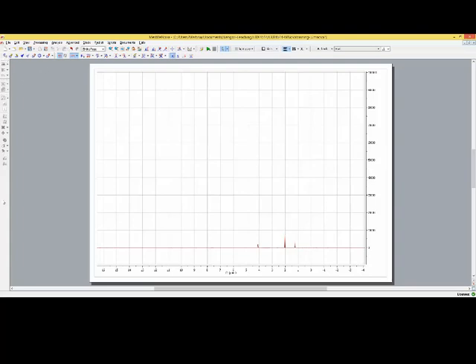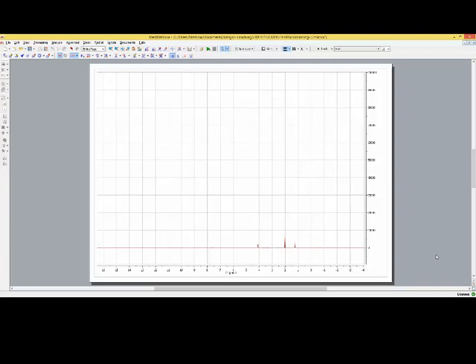On the left hand side we have more menu buttons but the one we really want to look at is at the license one here. You want to see this tiny little green hook. If this has any other color please contact IT services as soon as possible. But now we want to analyze our NMR spectrum.